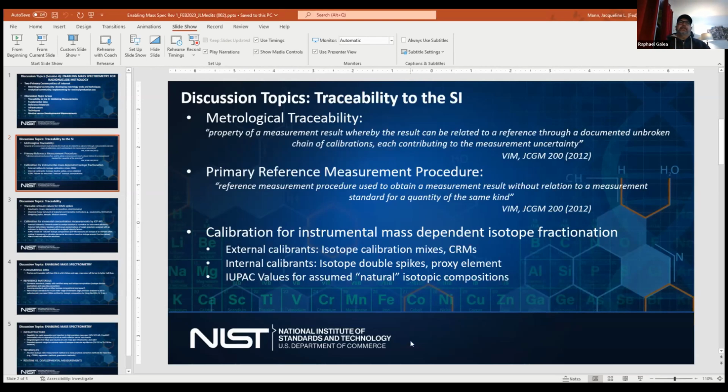So I think it's always important to remember that as well. In radionuclide metrology, oftentimes we call something primary, and when we have tracer methods, we call that primary, but it explicitly has a measurement of the same kind, of another isotope of the same. So there is some aspect of judgment from the different CCs as to what is considered a primary. But again, at the end of the day, that's not the critical point.